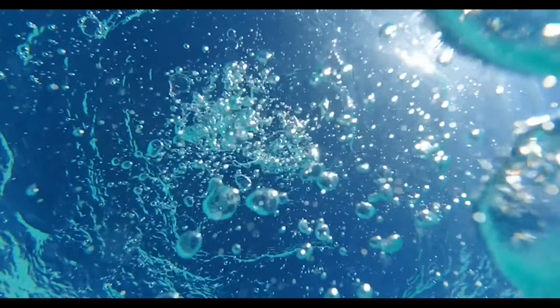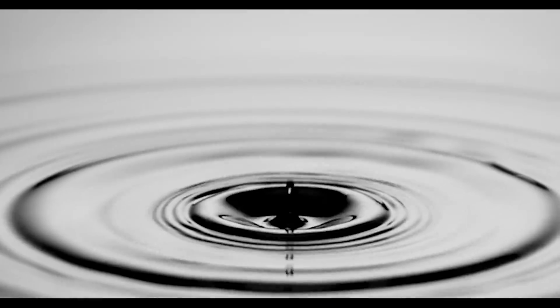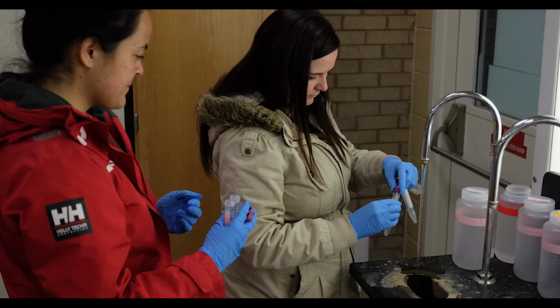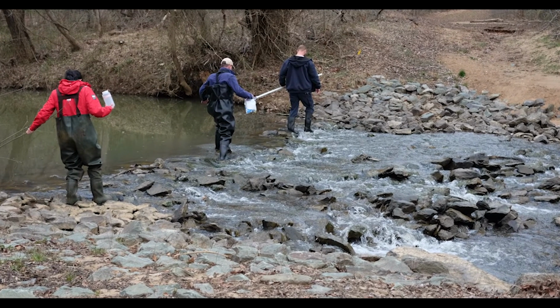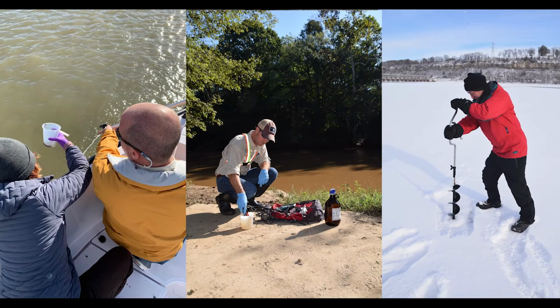These mass spectrometers are exquisitely sensitive. They can measure PFAS at concentrations in water down to part per trillion. That's like isolating a single water droplet in an Olympic-sized swimming pool. Back in 2017, we were among the first environmental laboratories in the country to get access to the very high-resolution mass spectrometers available at that time.